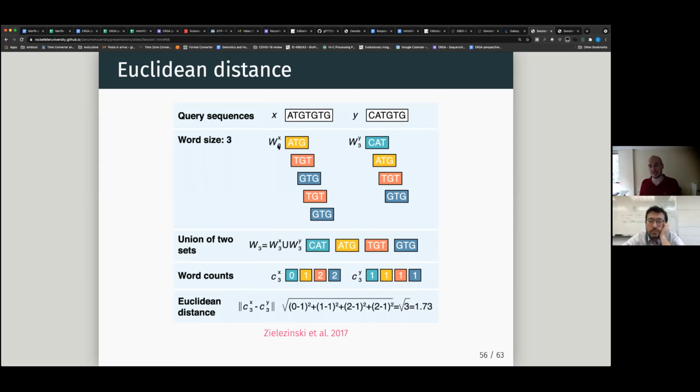Okay, you only define the length, and after that, you have basically a representation of all the sequences in your raw data. What the K-Mers are missing is the connections between them. So you lose the order. When you count them, when you have a table like this, you don't know anymore whether ATG came before TGT or not. That's where the K-Mers fail, and that's what the De Bruijn graphs are actually about. It's just telling you what is the connection between the K-Mers. Nothing more than that in essence.